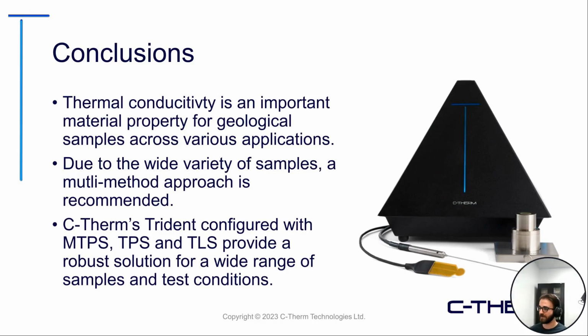But due to the wide variety of different types of samples and formats that they may be present in, really having a multi-method approach is generally recommended. Whether that's a transient technique, steady state, what have you, the highlight that I was hoping to get across is that these transient methods do offer some very unique flexibility with respect to the conditions and the setups that you can use.